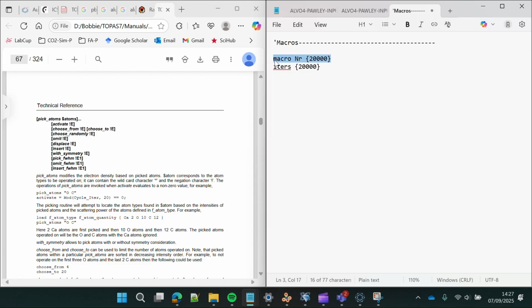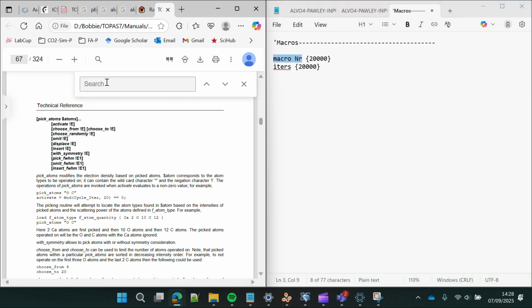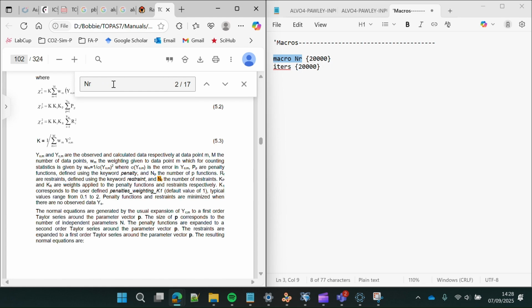So this macro, let's see if I can find it. What about if, or just NR?